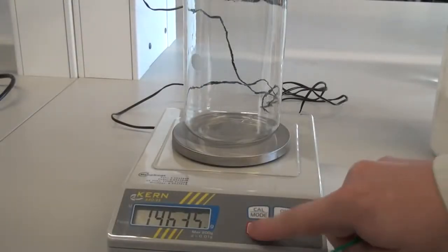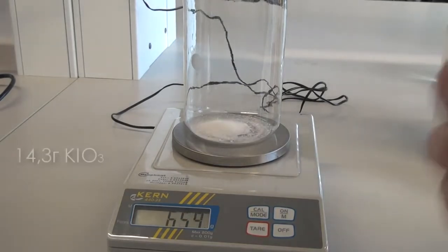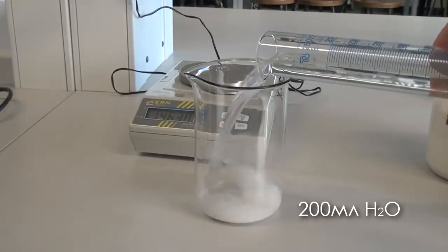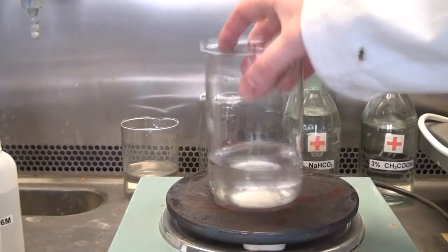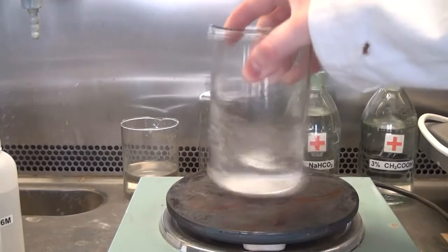To prepare the second solution we'll need to weigh the materials. Take a large glass and pour 14.3 grams of potassium iodate, then add 200 milliliters of water. As the solubility of potassium iodate in water is not very high, in order to accelerate the solution, heat the mixture on a hot plate.